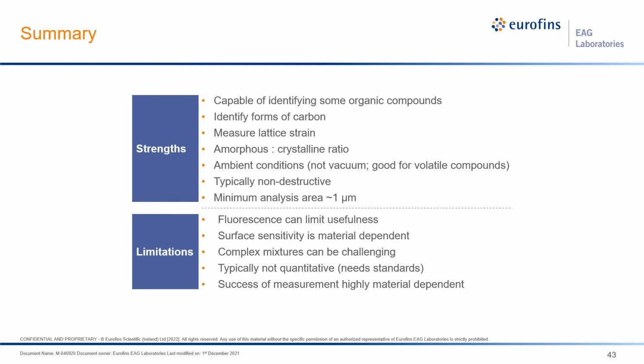The surface sensitivity is certainly material dependent. So if you have a very thin film, it might be challenging to do it by Raman. Again, just like with FTIR, we get all the peaks from all the compounds present. So if we have a complex mixture, the analysis can be challenging. And again, it's not quantitative without standards, although quite a few quantitative measurements are done using standards and using known literature information in our laboratory. And in this case, the success of the technique is really material dependent.